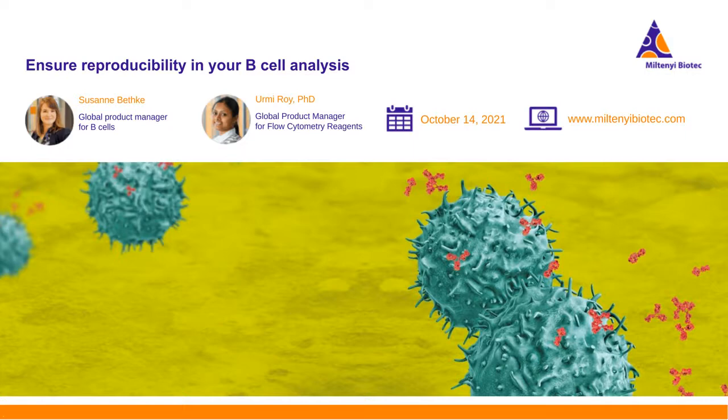This means that typically when you are building a panel with 7-8 antibodies, and the source is coming from another backbone, typically you can find a mouse or one generated in a rabbit and so on, you need to use every single one of those isotypes if you want to have the proper control.